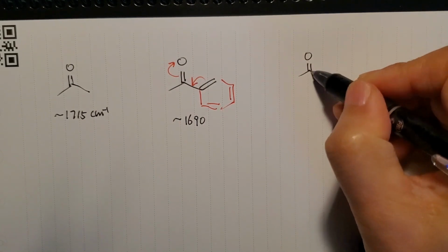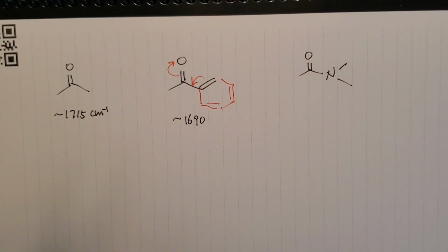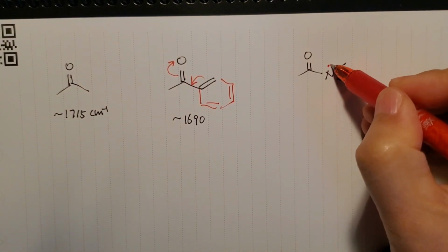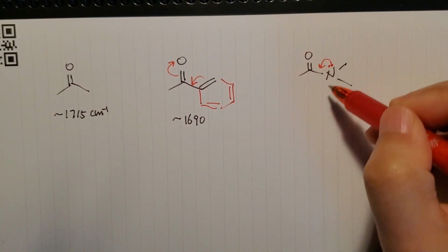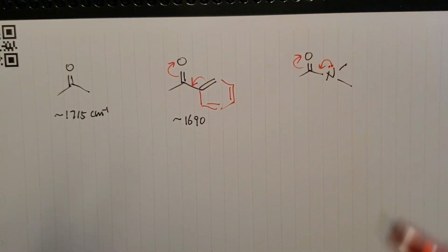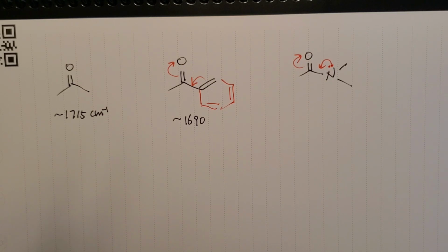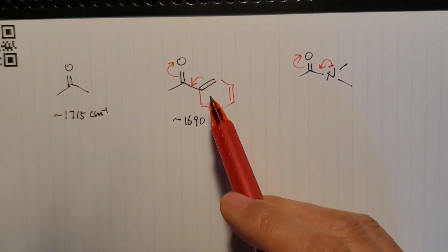You can have a nitrogen on it. Nitrogen is a fairly good electron donor. These are the atoms you find in the peptide bond of the amino acid of the protein. When you have that, the donation power of nitrogen is much greater than that of the double bond, because a double bond is not as basic as nitrogen.